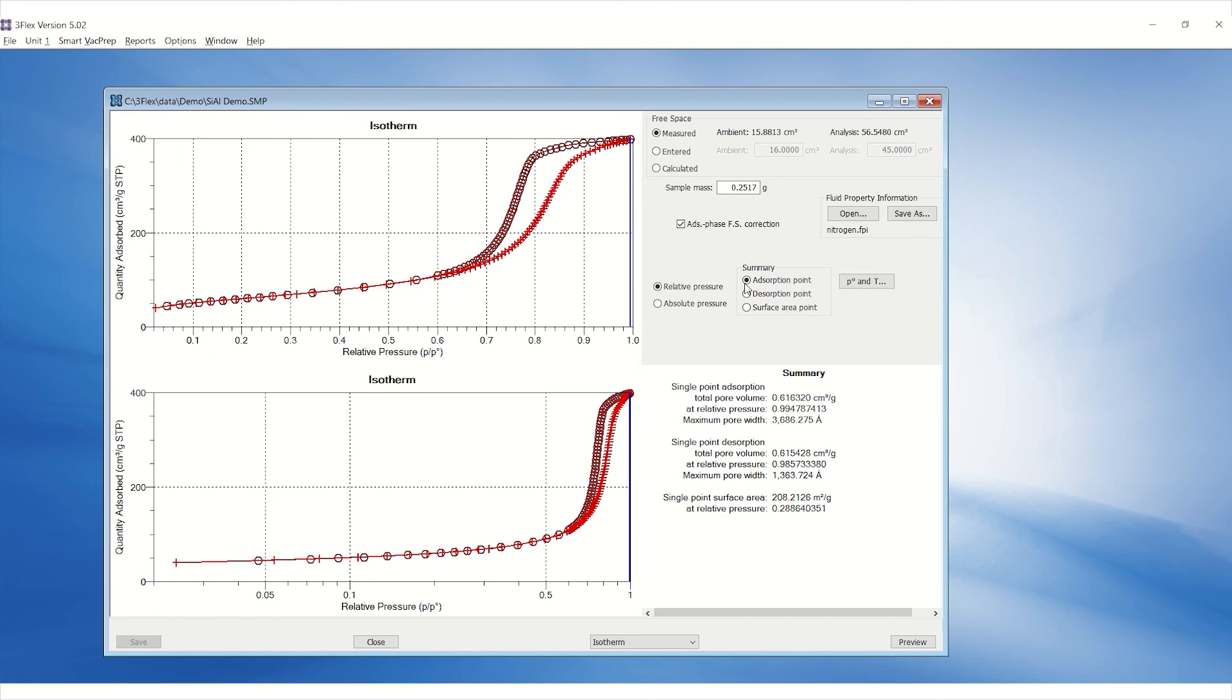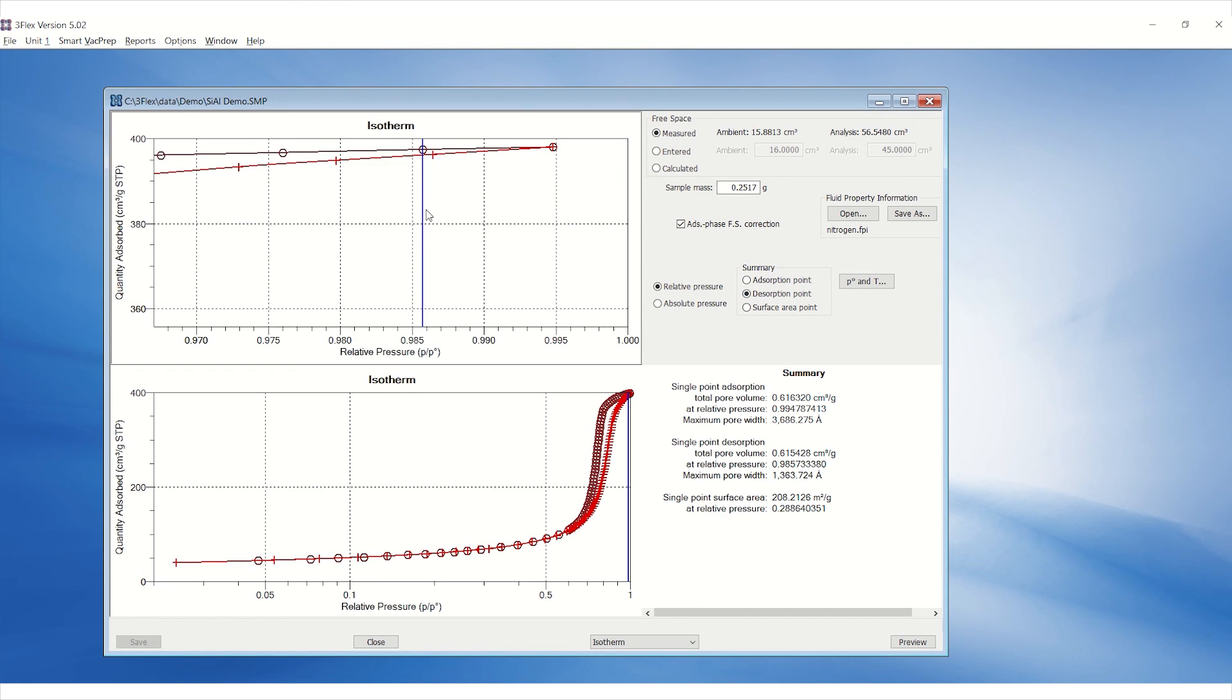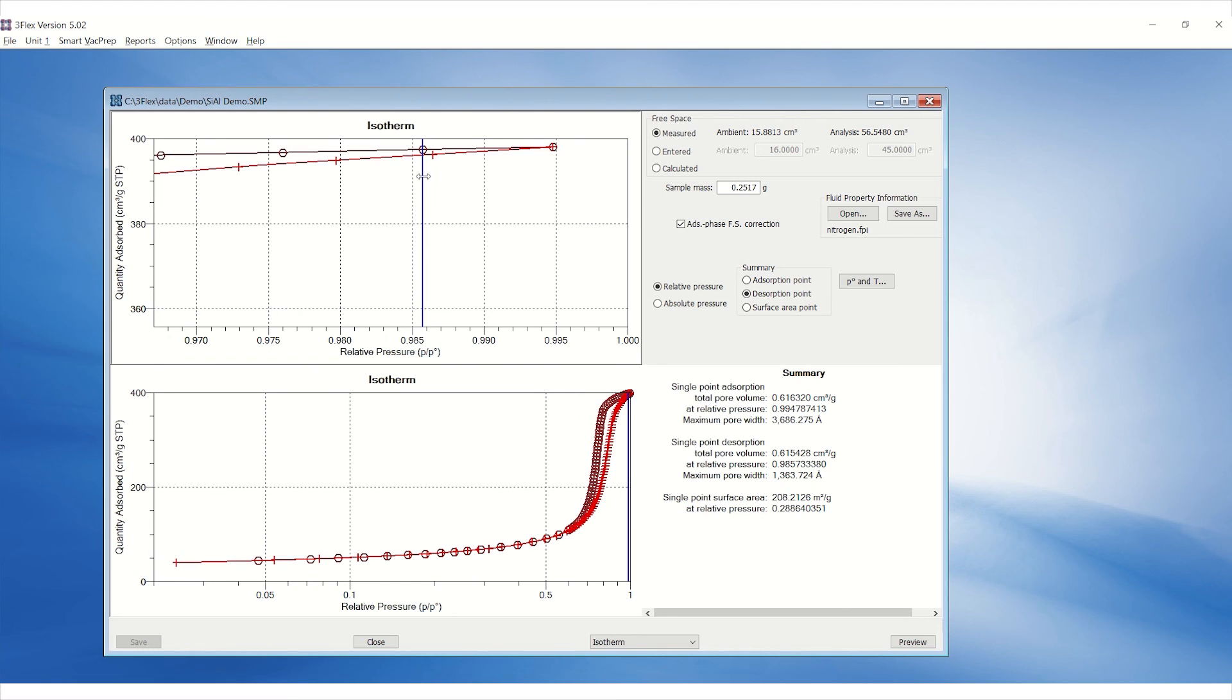Also, adjust the desorption point after selecting Desorption Point under Summary and ensure the blue bar is on the second highest desorption point on the isotherm.